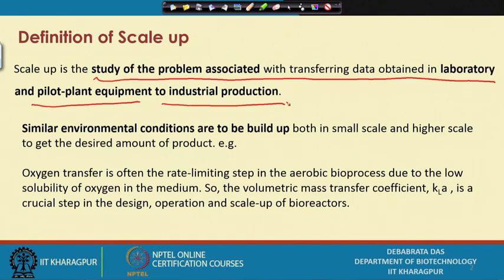Now the main purpose is that similar environmental conditions are to be built up for both the small and the higher scale to get the desired product. This is obviously the main purpose of doing the scale up.